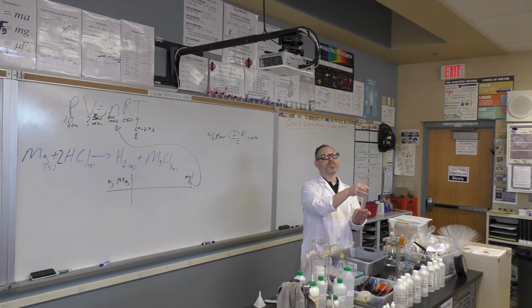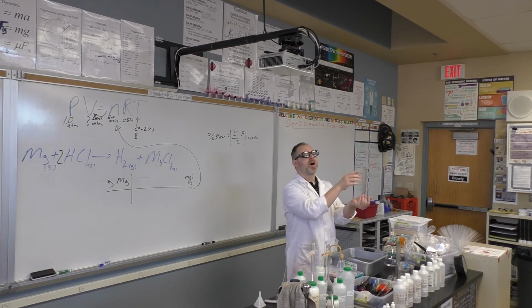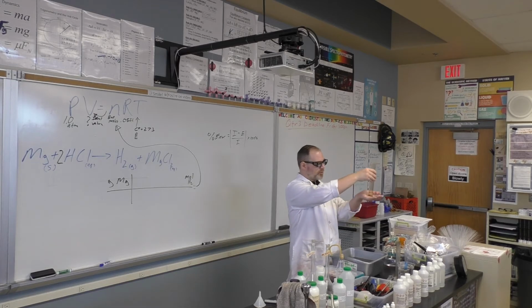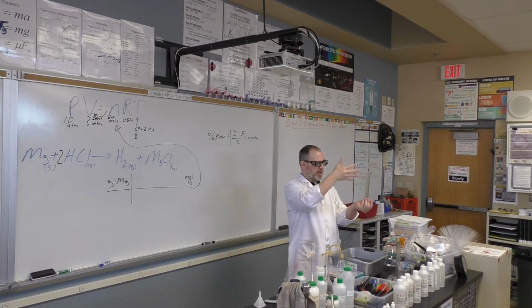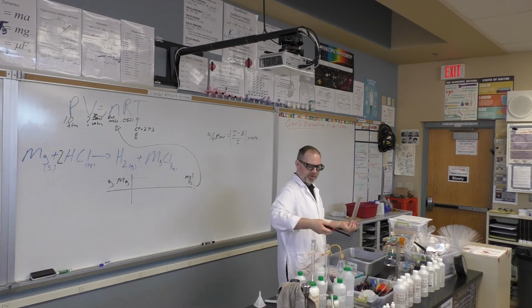Okay, now, why is it called the pop lab? It's called the pop lab because this next step is fun, but totally optional. First of all, hydrogen: more dense than air or less dense than air? Less dense, so it's going to rise. So I'm going to pour out some water, let the water go. And now I've got my hydrogen in here, and a lot of water vapor. I'm going to select my flame.